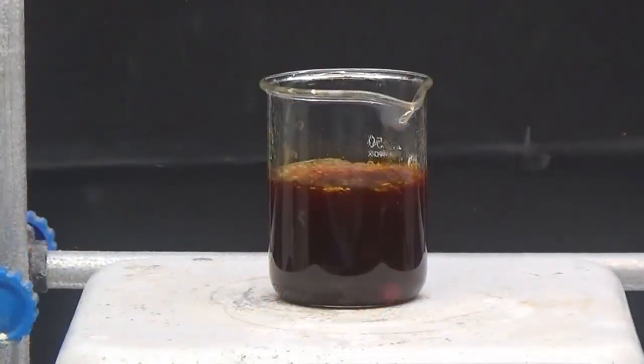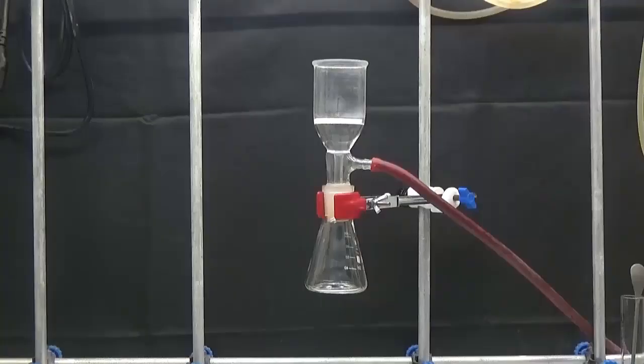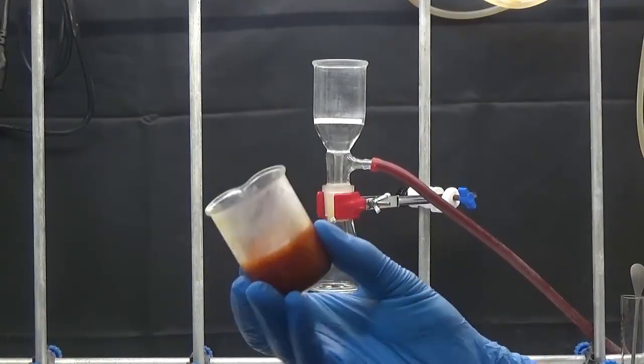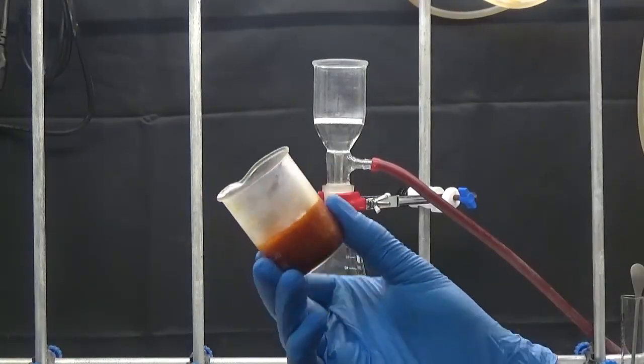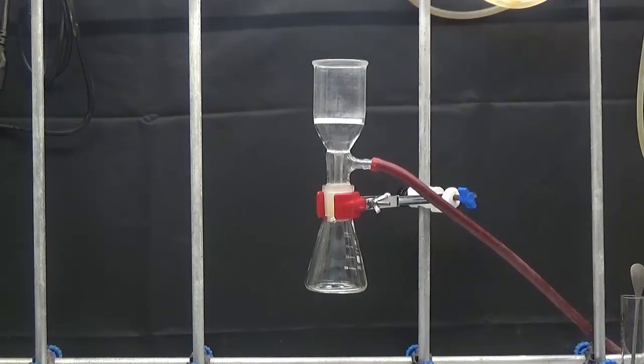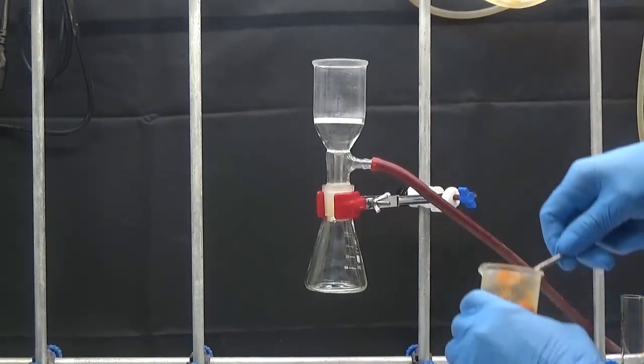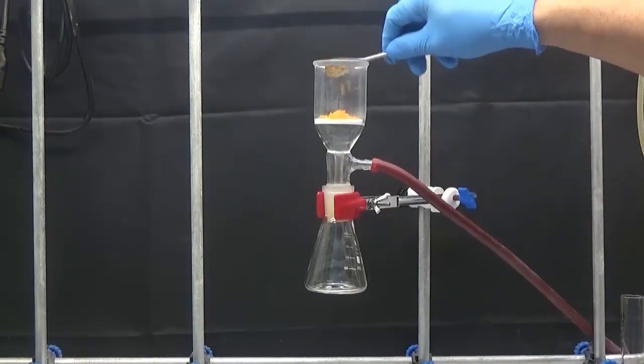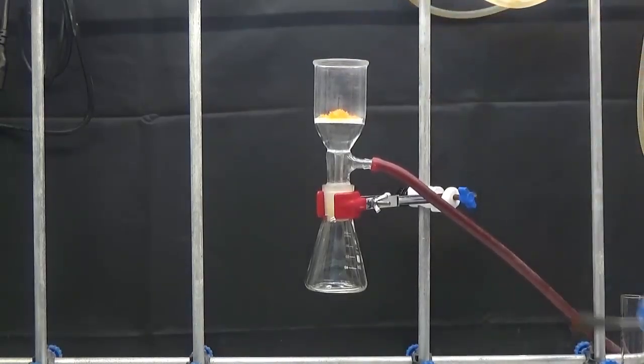4.4 grams of raw isatin was dissolved in 26 ml of boiling glacial acetic acid. Allow to cool to room temperature, then store in the refrigerator overnight. The mixture has frozen. We put it into a filter funnel and let it come up to room temperature.